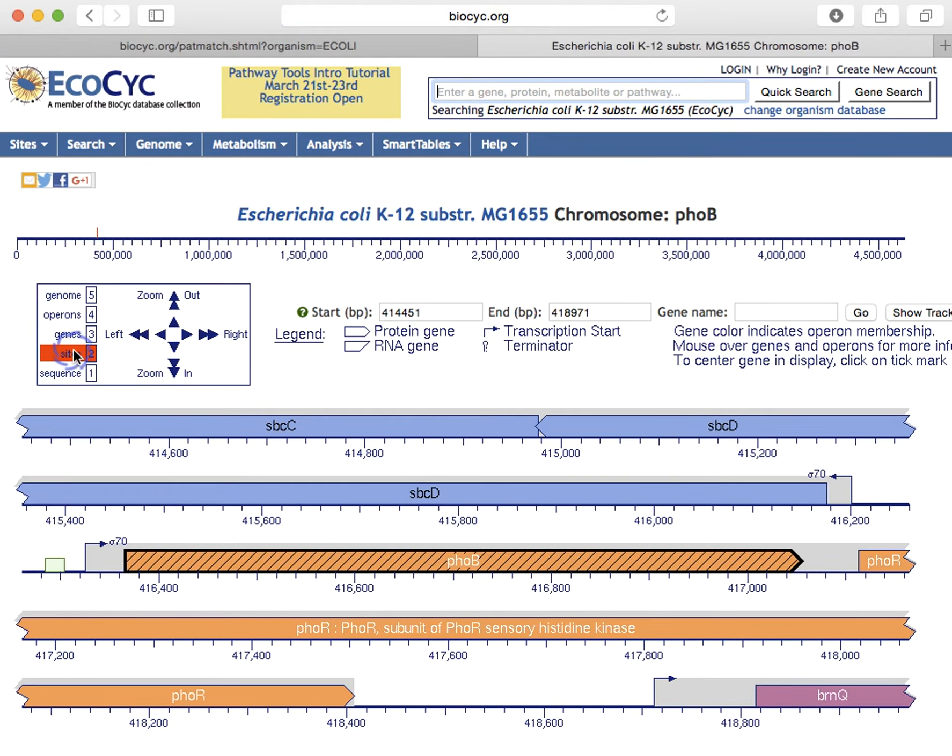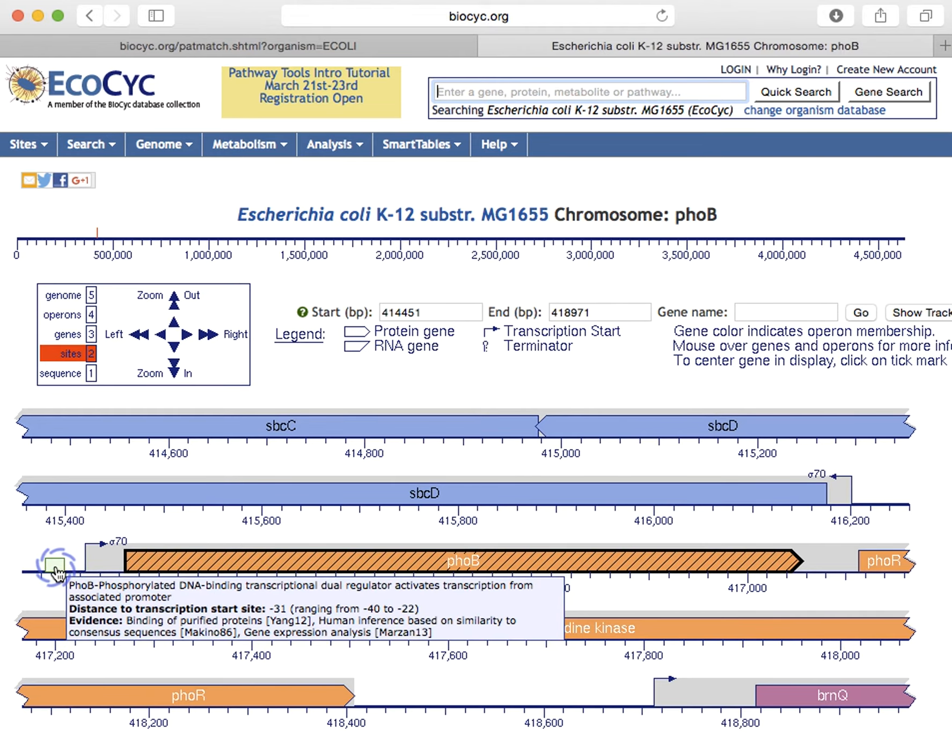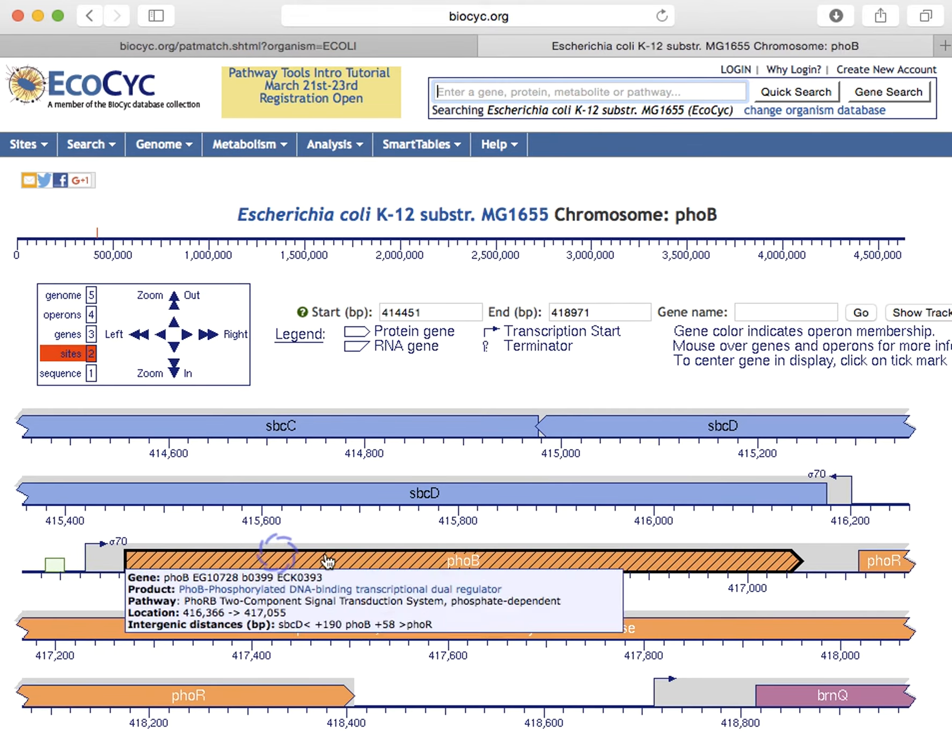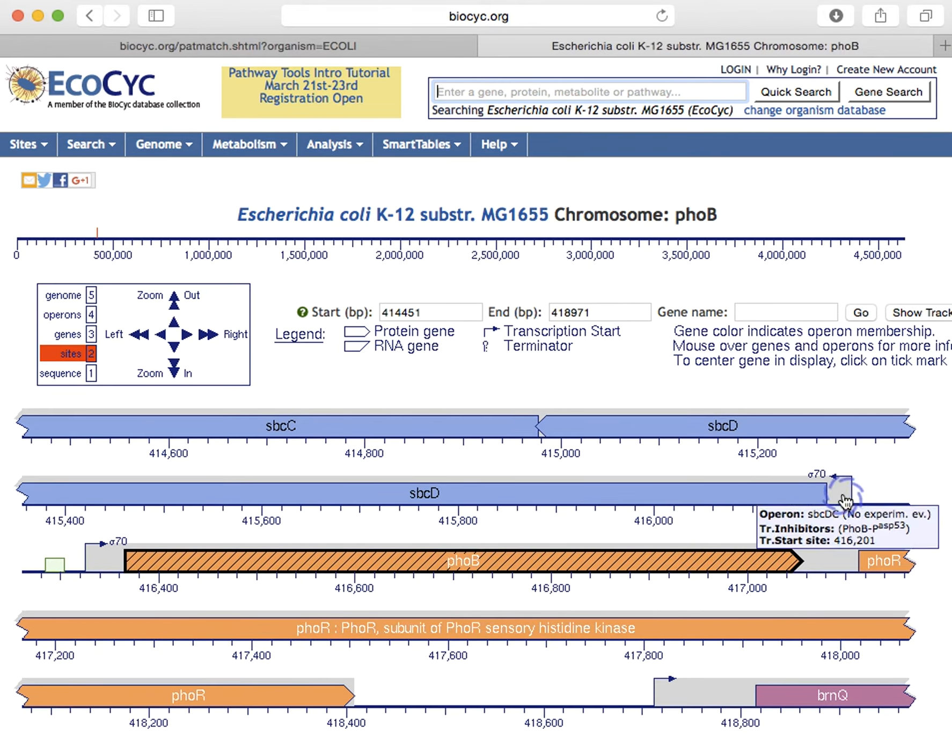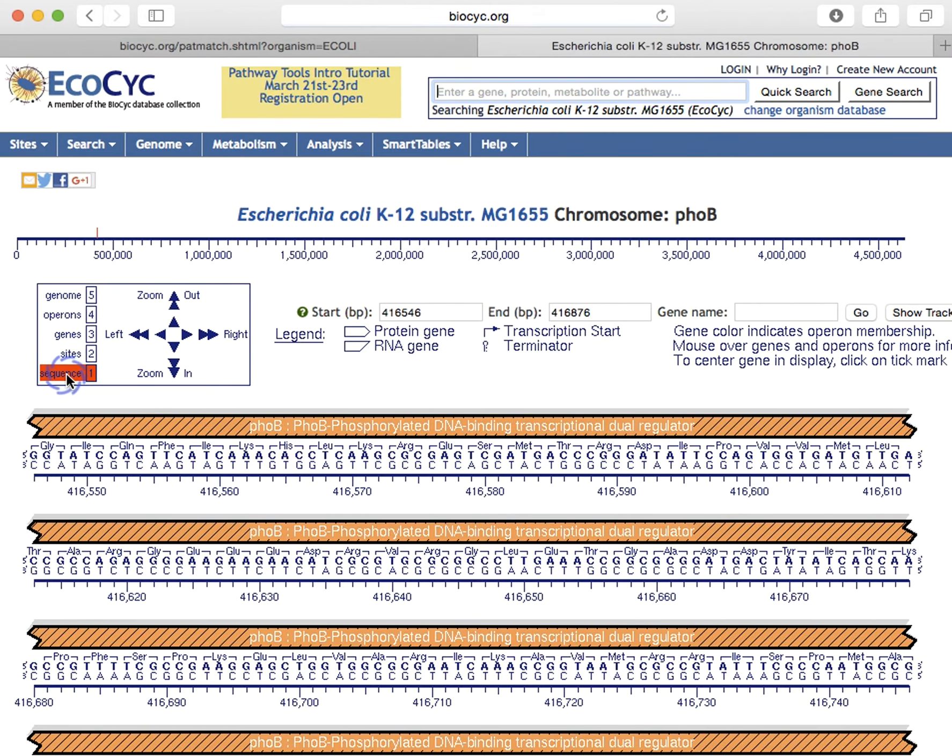These navigation tools can also be used to change the magnification level. So we can go into the level of individual binding sites. So here we see a transcription factor binding site in front of FOB. We see a promoter. And if we zoom in to the sequence level, we get this display around FOB.